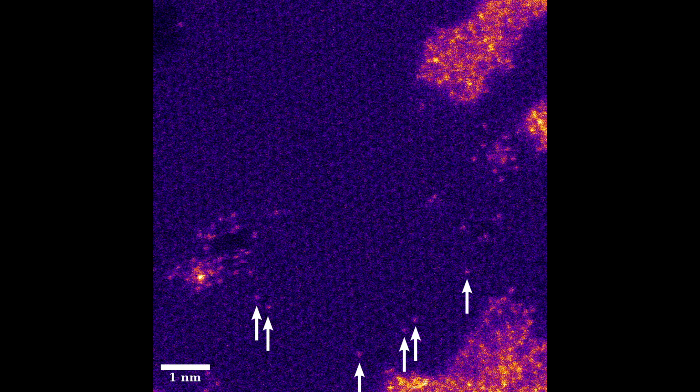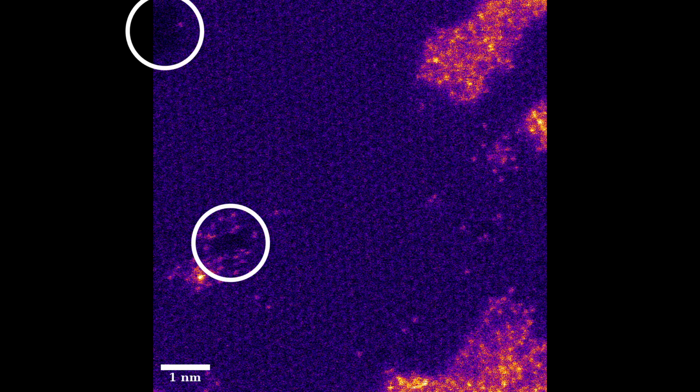The accelerating voltage used here was 100 kV, which is above the knock-on threshold for graphene. As a result, as we image the specimen, we gradually observe more and more beam damage because we are continually ejecting carbon atoms from the graphene. Occasionally, we also see these silicon atoms attached to the graphene. We hypothesized that the silicon atoms were attaching to vacancies or some other defect sites that were created by the beam damage, and that by scanning the beam across the specimen, we are sputtering a few silicon atoms off the nearby contamination and into the defect sites. The question is, can we do this intentionally?